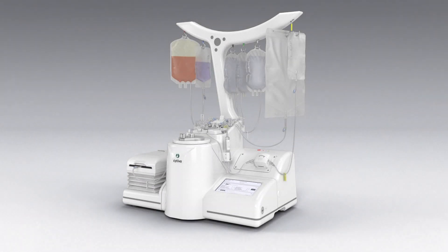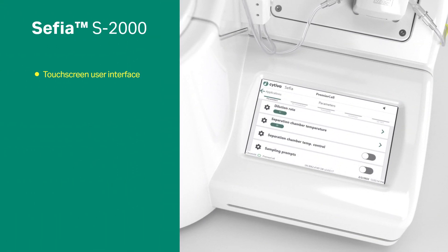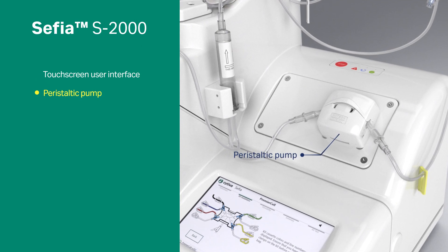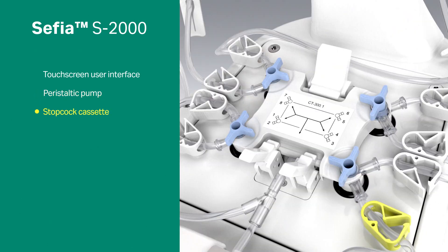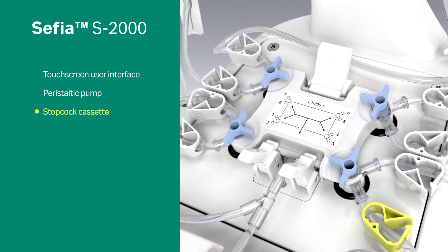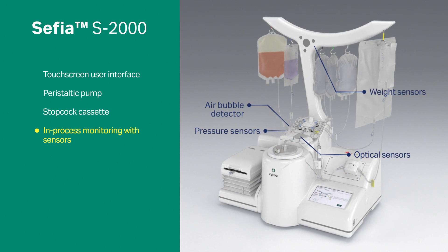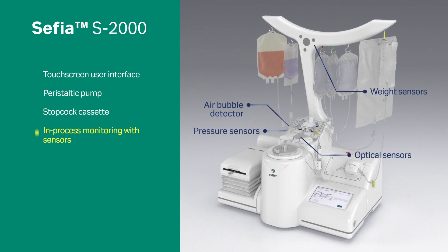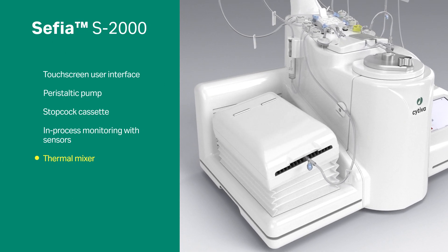The Sephia S2000 instrument main features include a touchscreen user interface, a peristaltic pump for continuous processing or precise fluid transfer management, and a stopcock cassette with eight independent fluid pathways and in-process monitoring with sensors, and a thermal mixer for the preparation and formulation of cellular product.